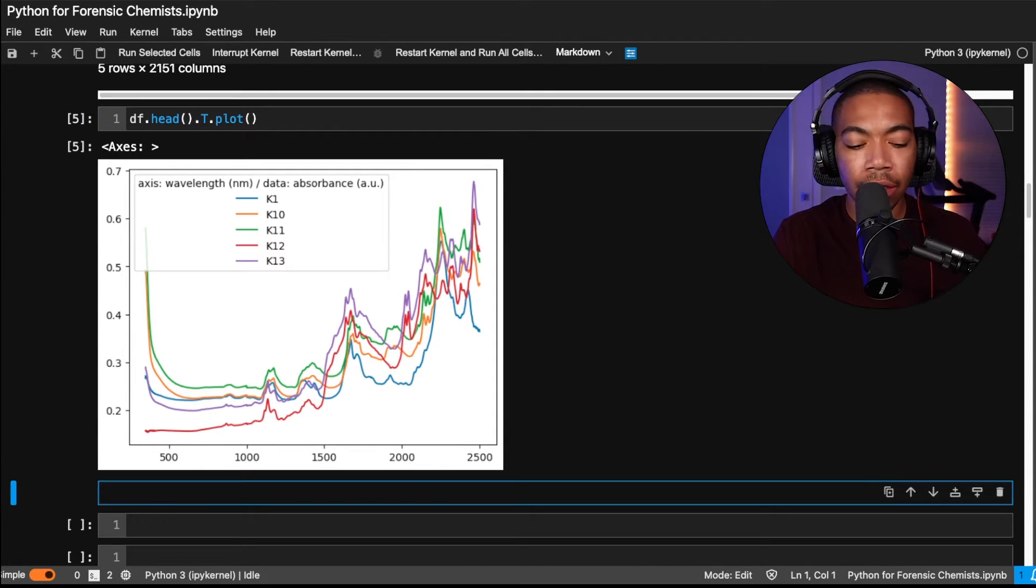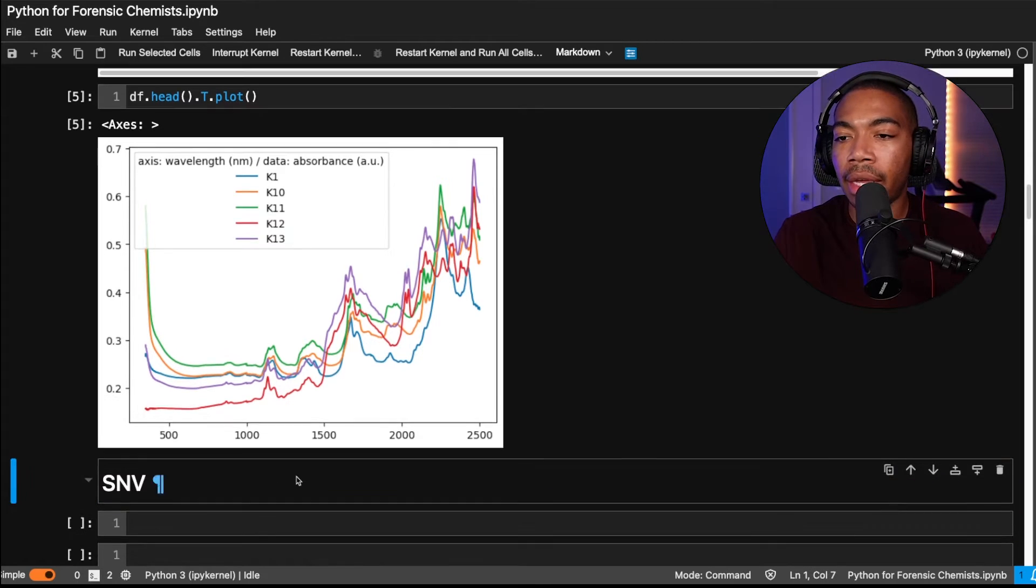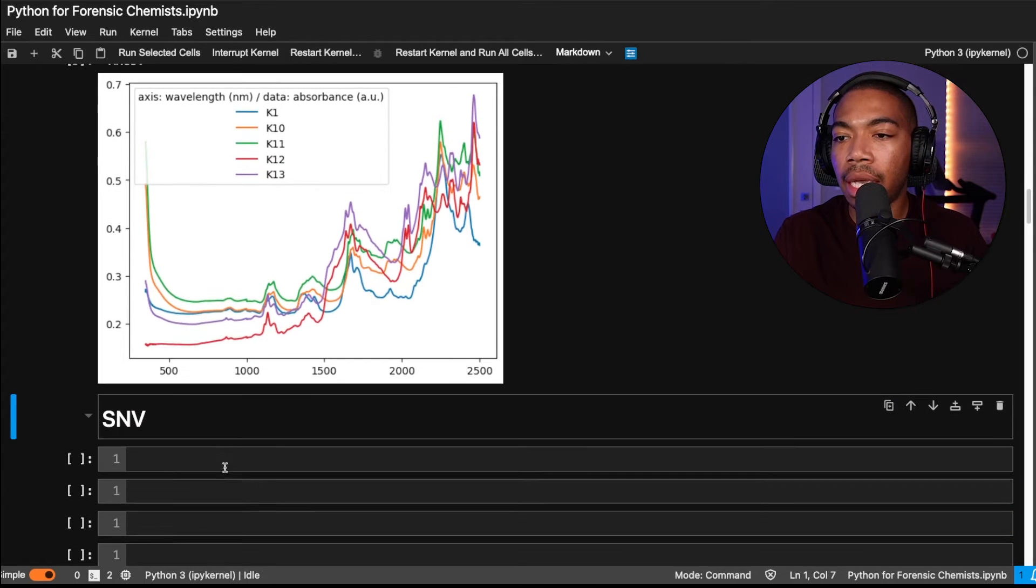So let's begin here. Let's just make a cell, let's just say SNV, run that, and let's begin.